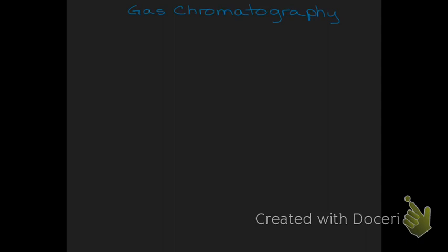So this video is really not going to be about this week's lab, which is thin layer chromatography, but it's really going to be introducing gas chromatography to you. Now, in order to understand what gas chromatography is, the first thing that you have to understand is what chromatography is in general. It doesn't matter what chromatographic technique in particular you're using.